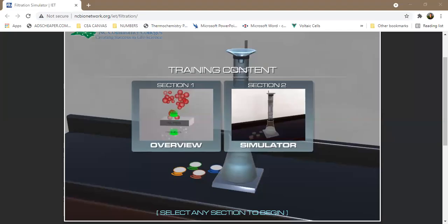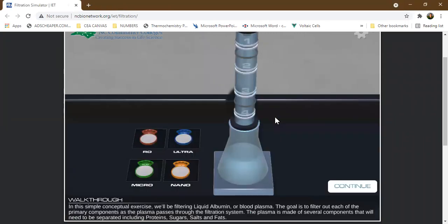This video is all about the section 2 simulator of our filtration experiment. Now let's click section 2. Now, this is the walkthrough of the simulator.